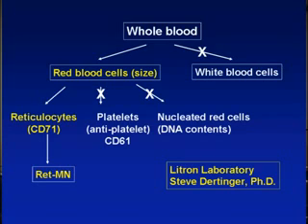But even within the red blood cells, you would have populations of immature red blood cells which still contain DNA, because the mature blood cells don't have any DNA or a nucleus in them. So you don't want to look at the cell population from this group. Also, you have platelets. They may also contain some DNA, and that will give you a false reading.